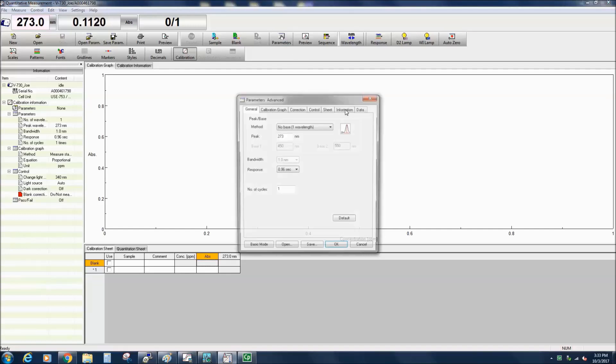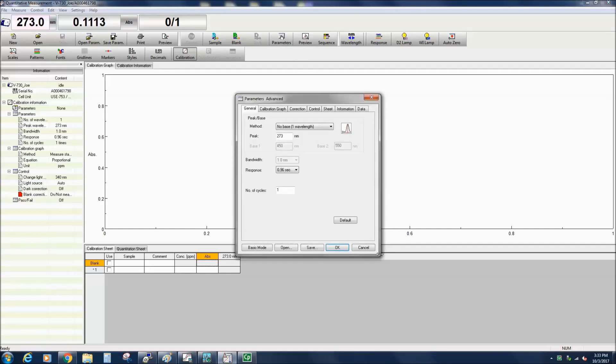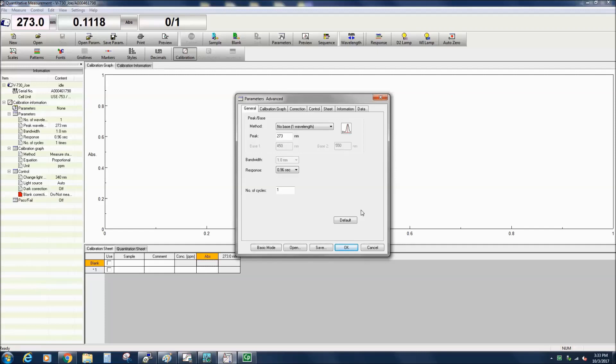To set up the measurement parameters, select the parameter icon in the menu bar or click Measure Parameters. The parameters can be switched between Basic and Advanced mode.